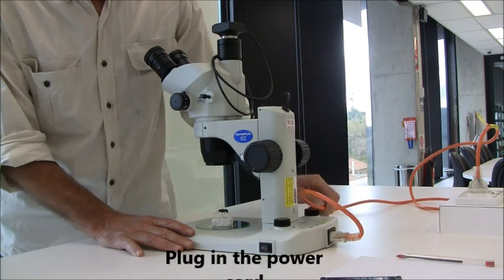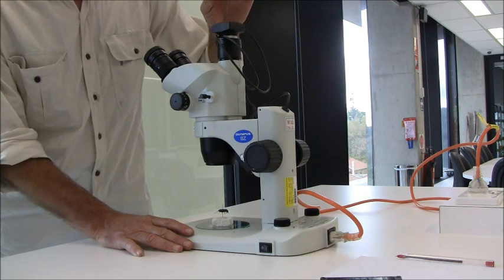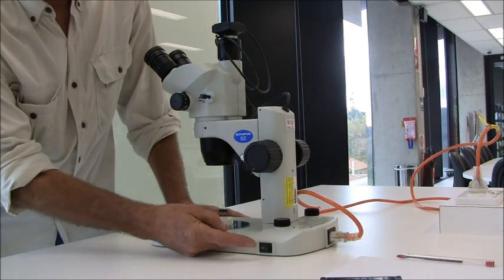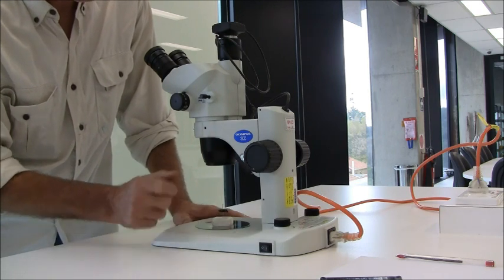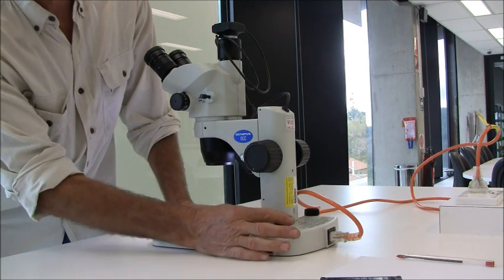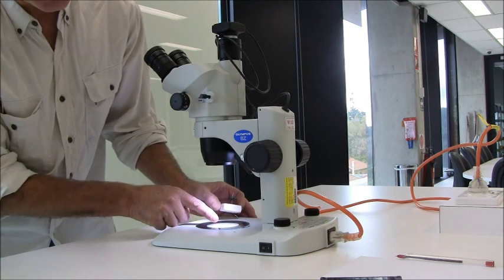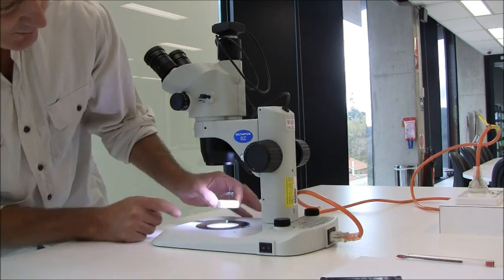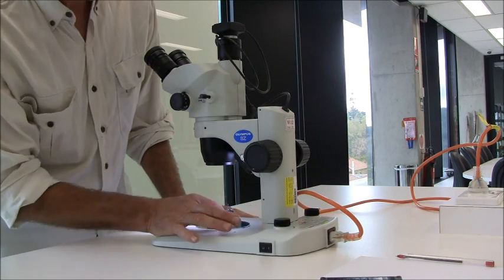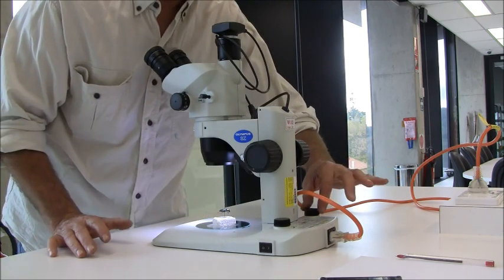The first thing we do is plug in the power cord and plug in the USB for the camera. The first thing I'll demonstrate is the light, and the light is very important — getting the light wrong is often one of the main mistakes students make. It's simply the on switch and the intensity dial. You can direct the light from two different paths: from below the specimen using the light intensity dial on the right, or you can direct light from the top using the dial on the left.